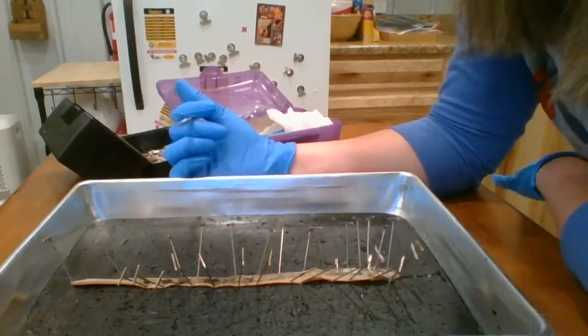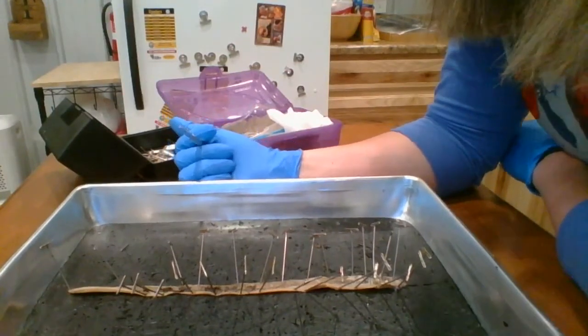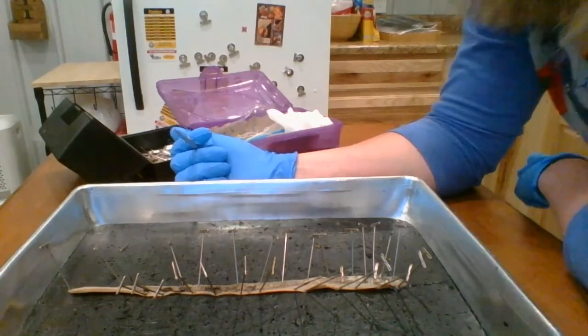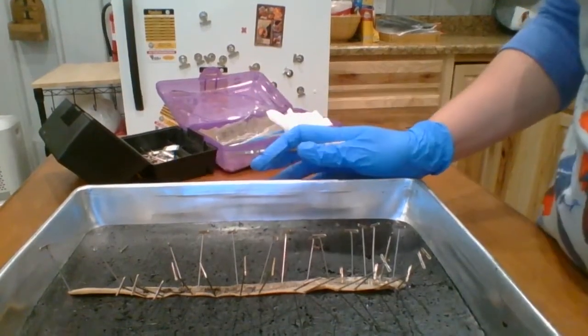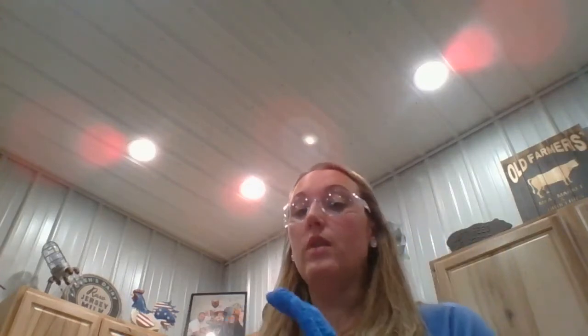We have talked about the worm in terms of what it eats. It's a detritivore, so it's going to eat enormous amounts of soil where there are dead and decaying plants and animals. Once the food enters the worm's mouth, it's going to move to the pharynx. The pharynx is a muscle that's going to push the food into the esophagus.